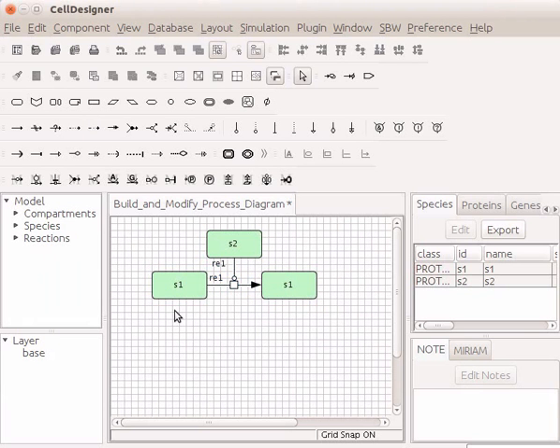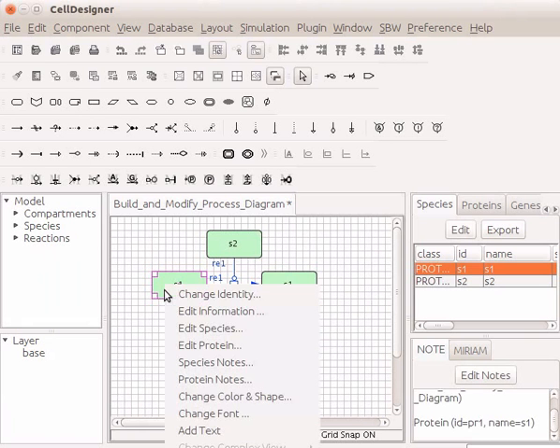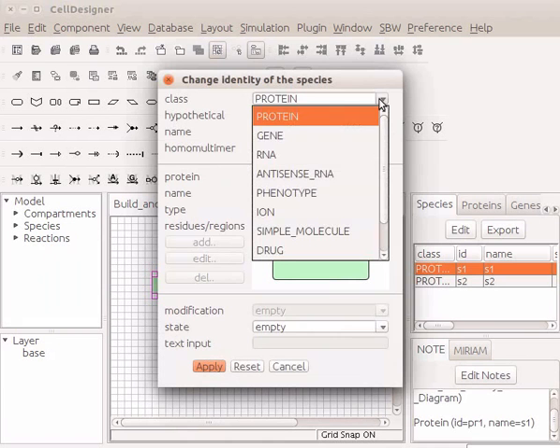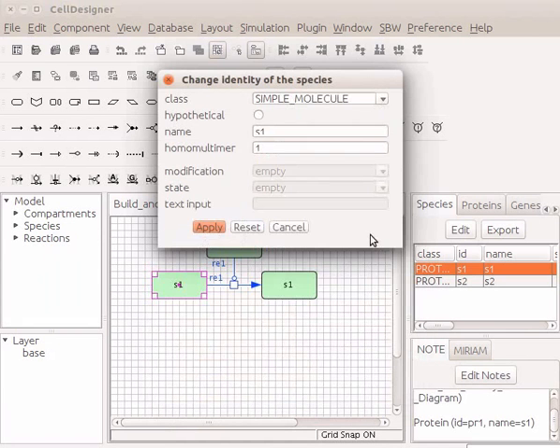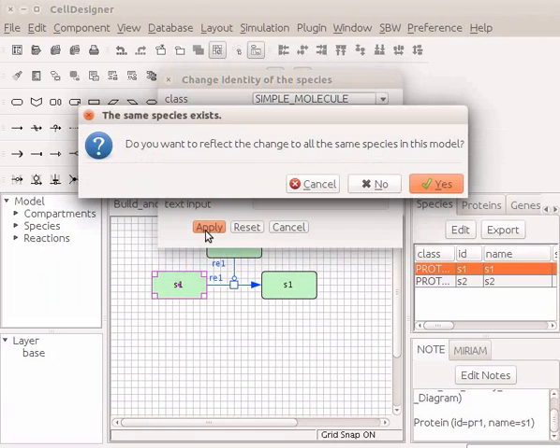On the draw area, right-click on the generic protein S1. Then click on the option Change Identity. In the class box, change the protein to Simple Molecule. Type the name as 2-Keto-Isovalidate and then click on the Apply button.